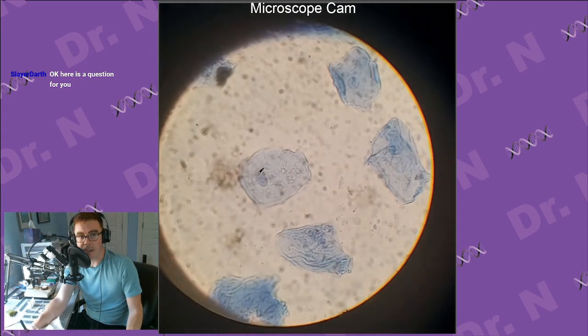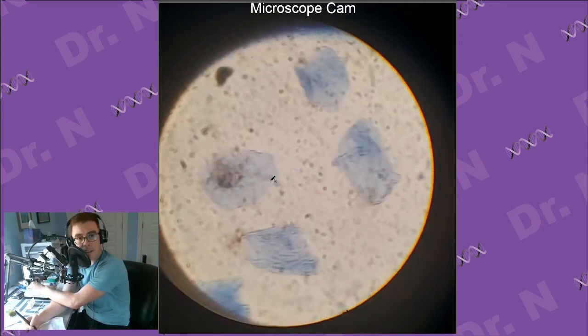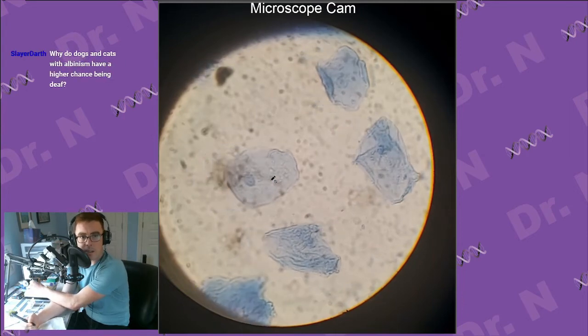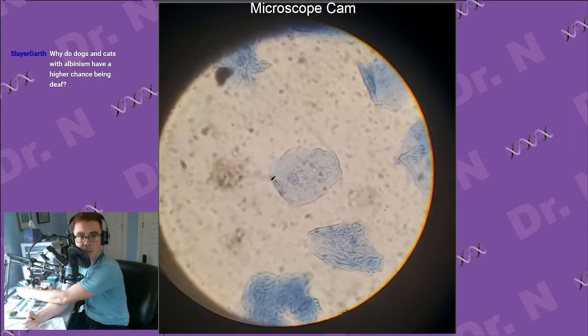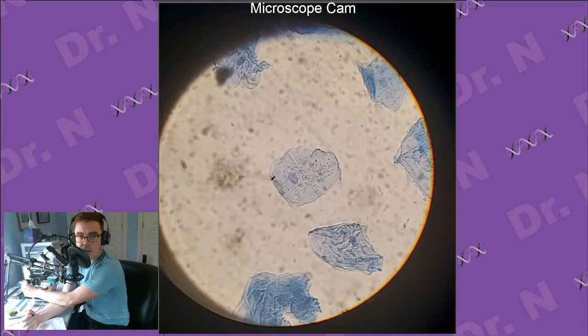As you're typing out, I will point out that this darker space in the middle, that is the nucleus. That's exactly what I was hoping to see. If you remember, when I was back on that Drosophila larvae, the cells were much, much smaller. Human cells are huge.